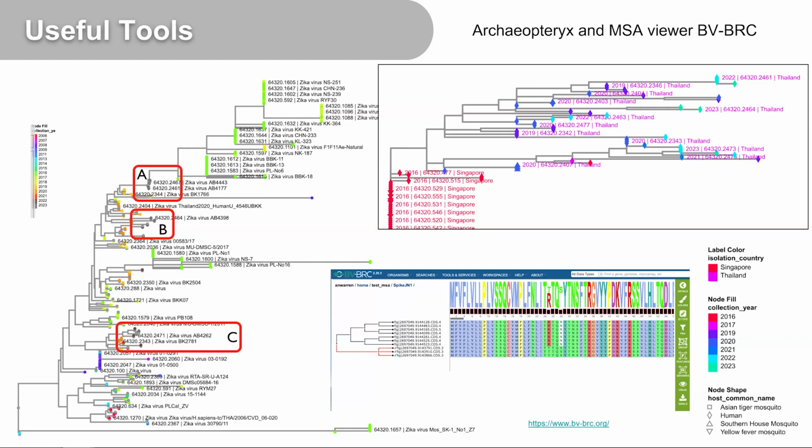It's also available as a download. It's one of the benefits of BV-BRC. One of the strengths is the different types of metadata that you can bring in and pretty easily associate with different visualizations, and interact with these diagrams, make different groups of things and take them away and do whatever you're going to do.